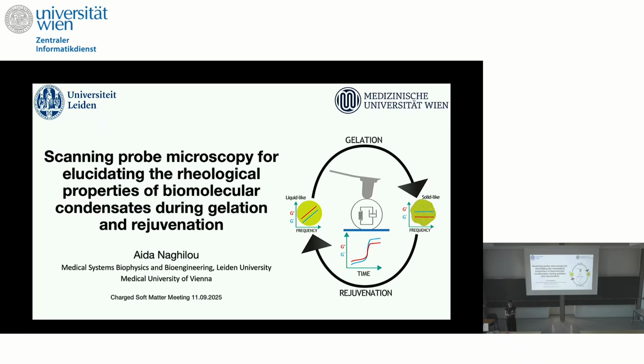I have to say, as a materials chemist who works in the field of biomaterials and biomedical applications, the conference has been very inspiring for me. I have learned a lot from all of you as experts. So I hope that I can give a little back and motivate you that the AFM or the SPM that some of you might have in the corner of your labs can actually give you very nice rheological measurements of your biomolecular condensates and coacervates.